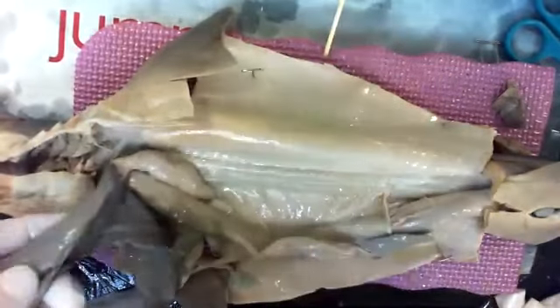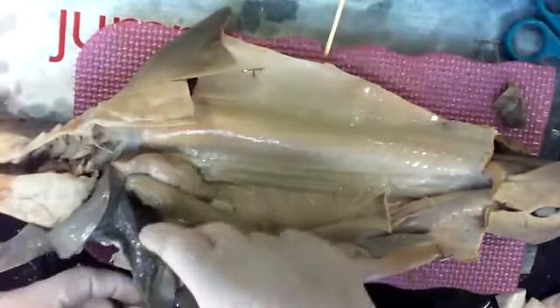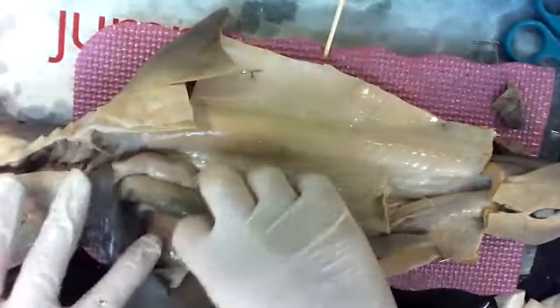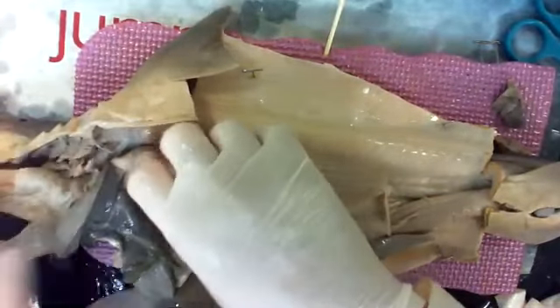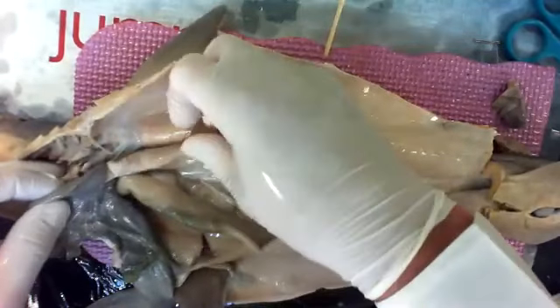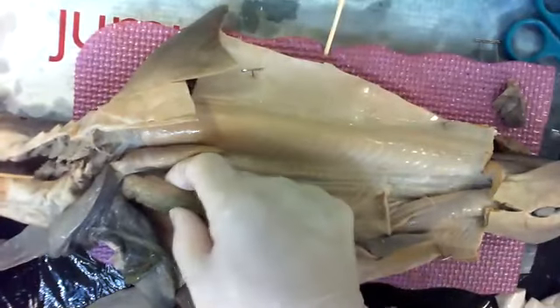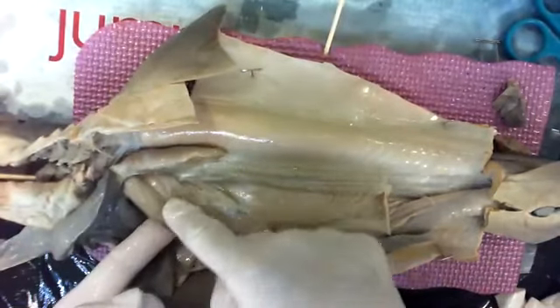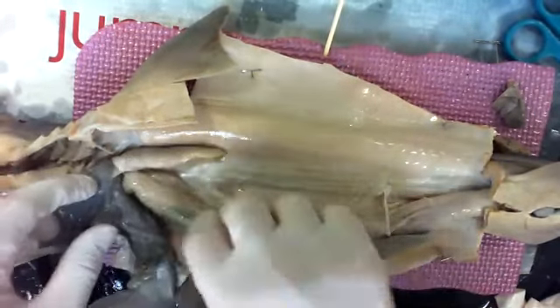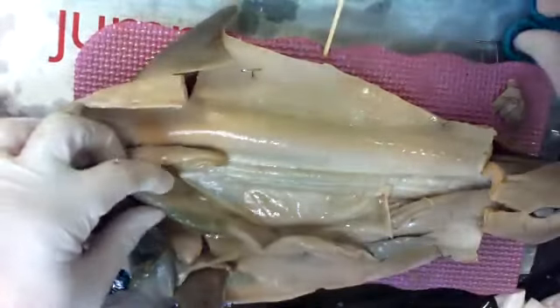All right, let's move these out of the way. So I just pulled the liver back. There we are. Now I'm going to find out where this probe is going. It's either going to go into this thing or this thing. So I'm going to wiggle it down. Oh, I can already feel it's right here. So mine's in this sac. This sac or line, I'm going to cut open.